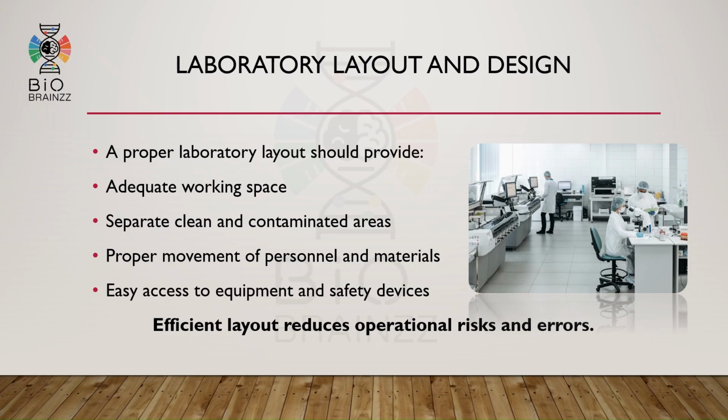Laboratory layout is also very important. A poorly designed laboratory can create confusion and safety risk. A proper laboratory design should provide enough working space, separate clean and contaminated areas, allow smooth movement of personnel and materials, and provide easy access to equipment and safety devices. Good layout planning reduces operational errors and improves efficiency.